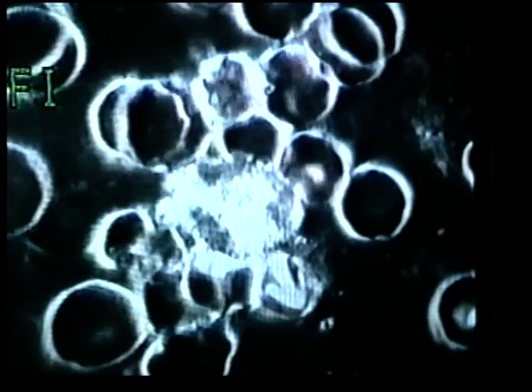Depending on which parasite frequencies are going, we get different kinds of movement, agitation into those parasites, causing a lot of agitation and a lot of the parasites to be released from the red blood cells out into the bloodstream so that the white blood cells can go to work on them. They've got something captured right here and right here in this granulocyte right at this time. Now this is a granulocyte that's working.